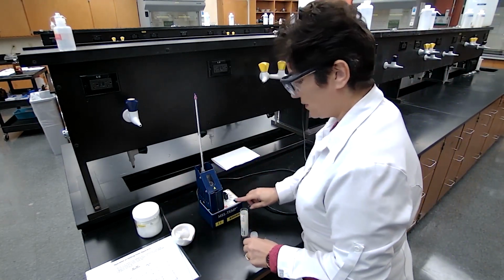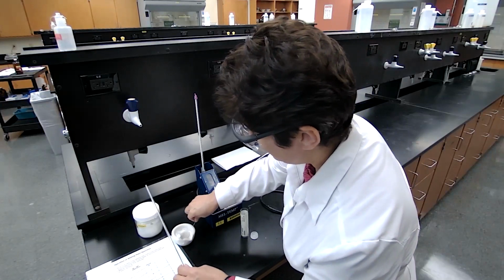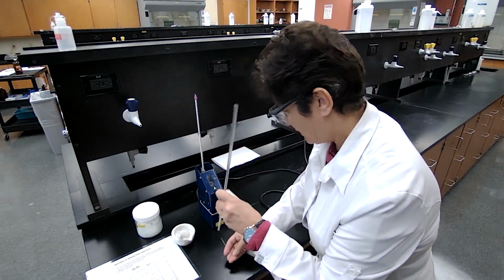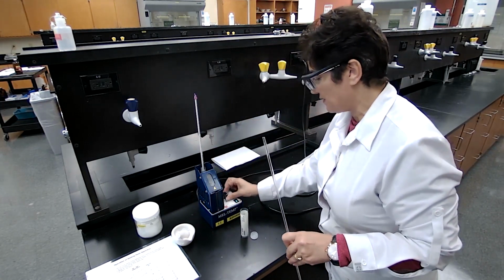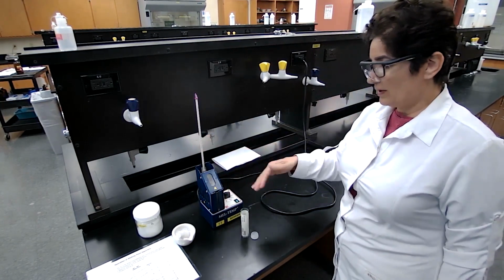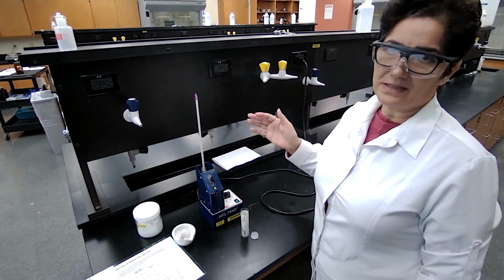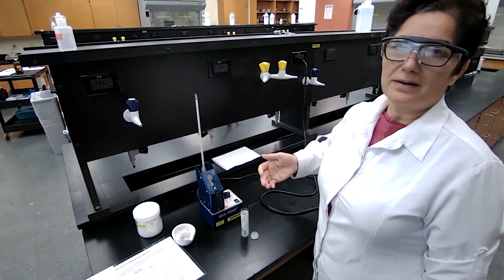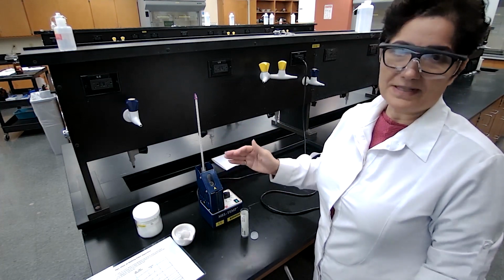So to do the melting point, I'm using one sample for a quick melt. With the quick melt, we're going to get the sample melting at a high setting of the power regulator. This is my quick melt, which I'm not using for data collection, but I want to know the approximate melting point, and then I use the chart for setting. Carboxylic acid has a high melting point, and I use that analogy using a quick melting sample. It's always the best way to go.